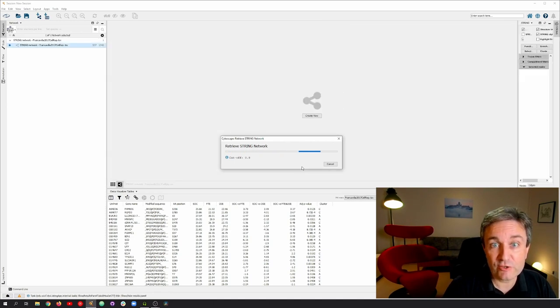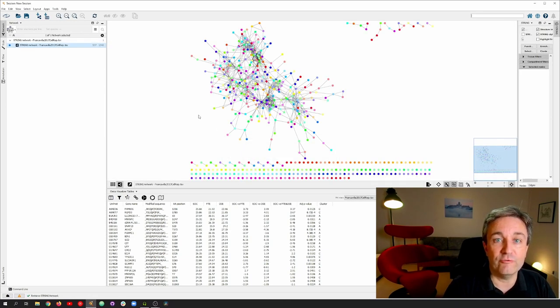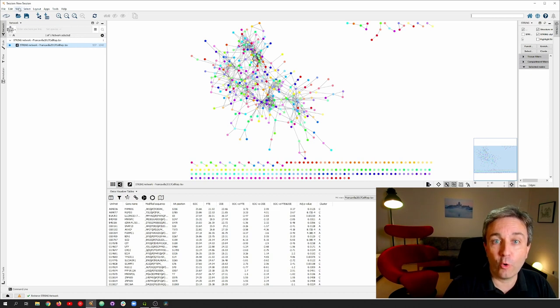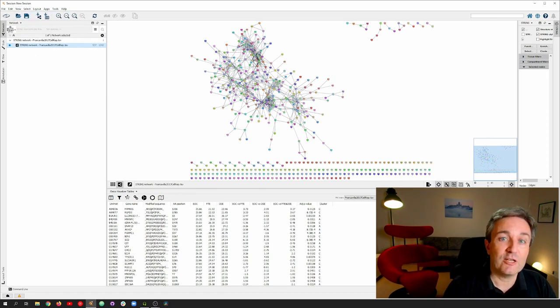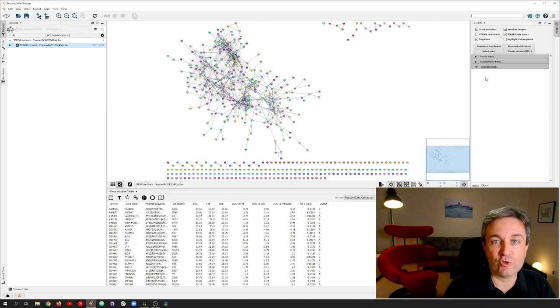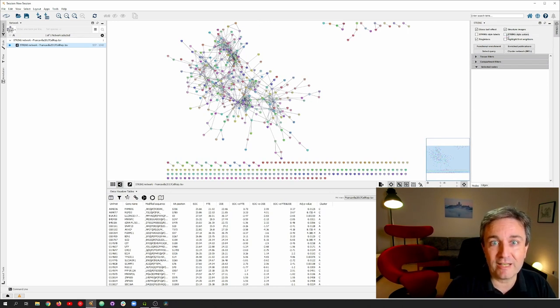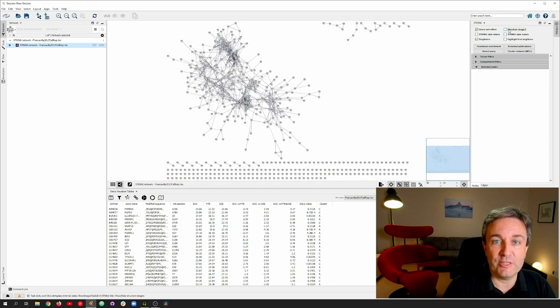Since this is a rather big network, I need to go to the View menu and turn on Always Show Graphics Details. I adjust the side window of String and turn off the String colors to make the visualization less confusing later, and turn off similarly the Show Structure images.